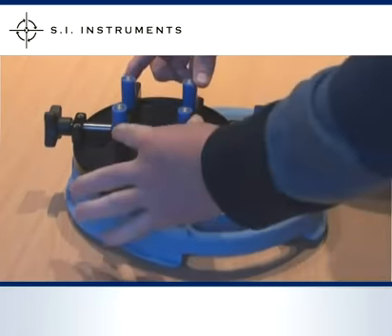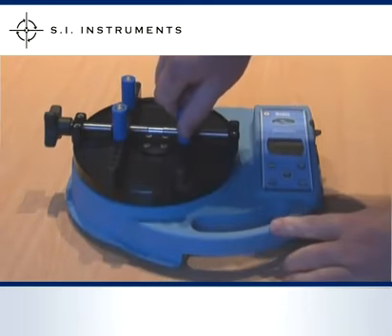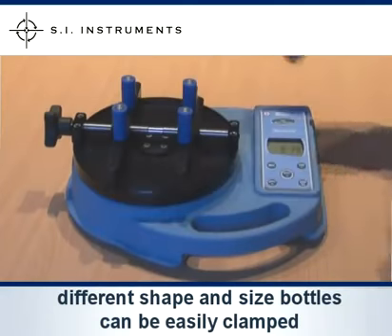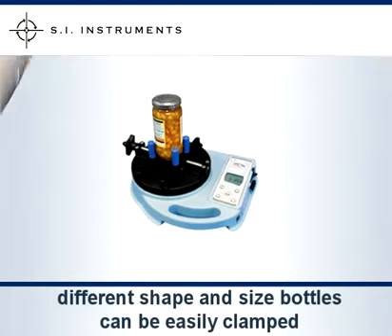There are four adjustable pegs which screw into the two cross bars. Different shape and size bottles can be clamped. Custom made accessories can be made to fit caps on flexible pouches and caps that are fitted on an angle.